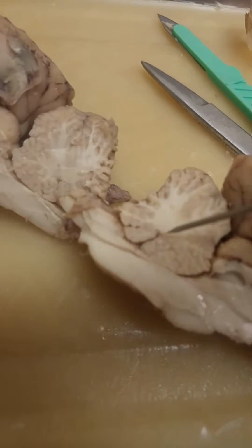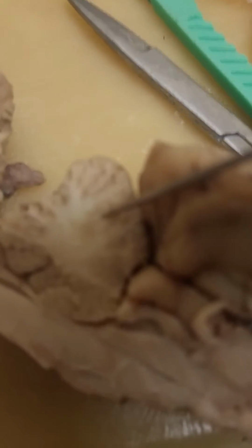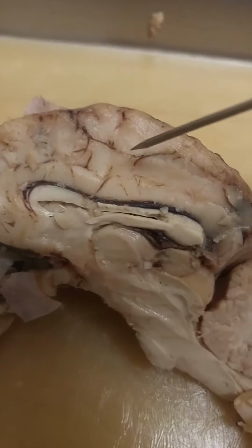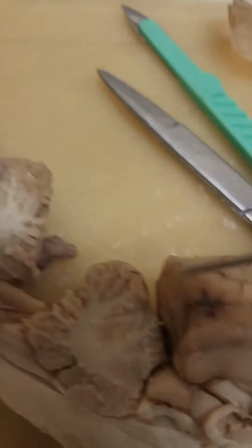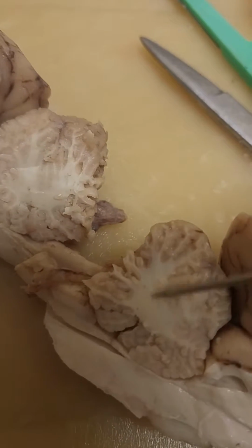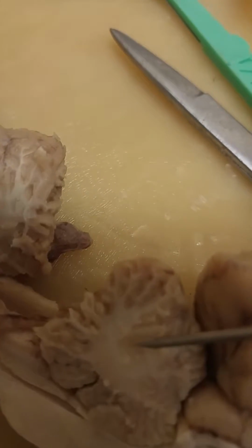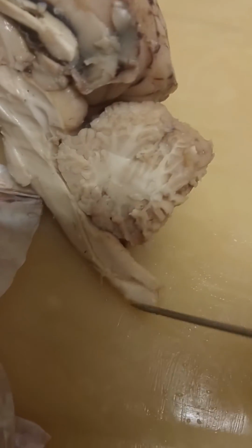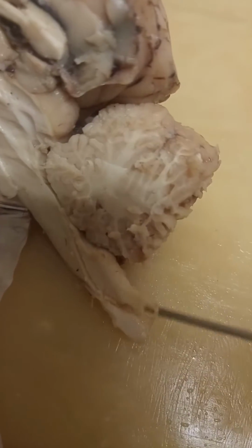That's the fourth ventricle. Here, this is white matter, and this darker color in the cerebellum is gray matter. Also, over here in the cerebrum, this would be white matter, and up here, this darker color is gray matter. But back to the cerebellum, this tree-like figure in the middle of it is the arbor vitae. And then the dorsal and ventral roots of the spinal cord would be down here. You can see how they separate.